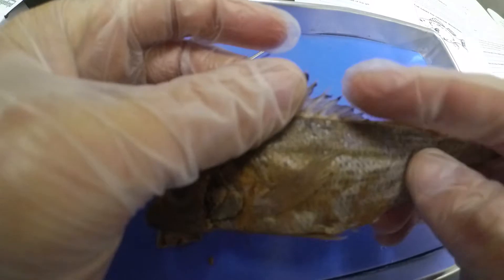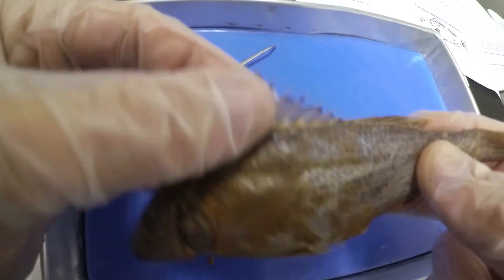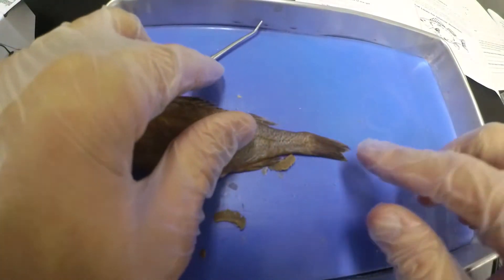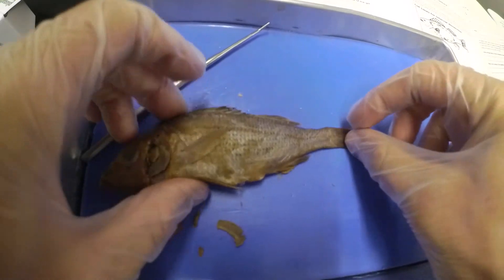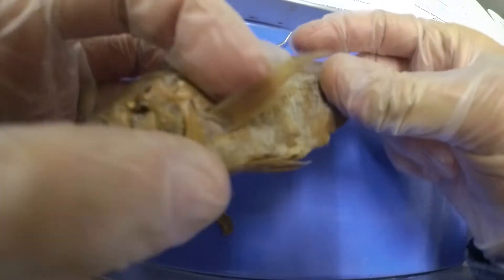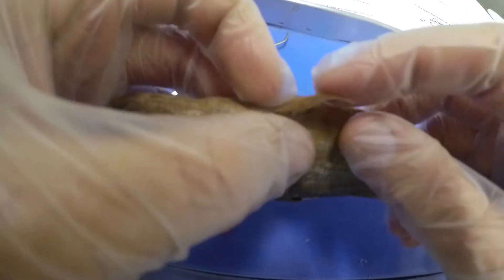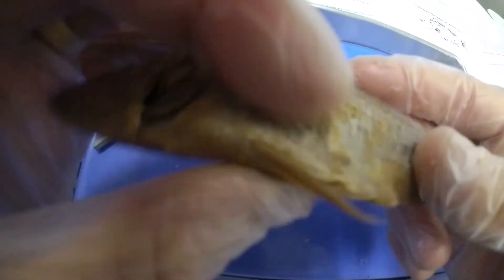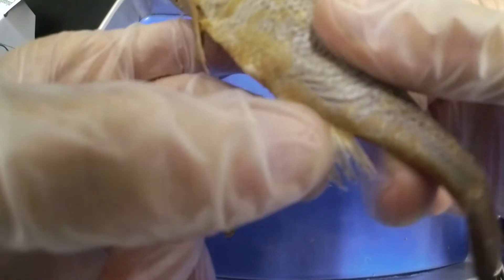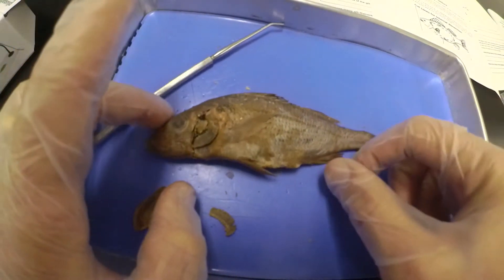We've already talked about how the fins can be used as a defense mechanism. Let's locate our fins before we start cutting. We had the anterior dorsal fin already; there's a second dorsal fin behind it that's softer without the thick spines. In the back we have the caudal fin — we saw it was forked earlier. In the middle we have the pectoral fin, very thin and raspy looking. On the bottom we have the pelvic fin — one on each side, soft. And we already looked at the anal fin, which is very spiny, used for protection.